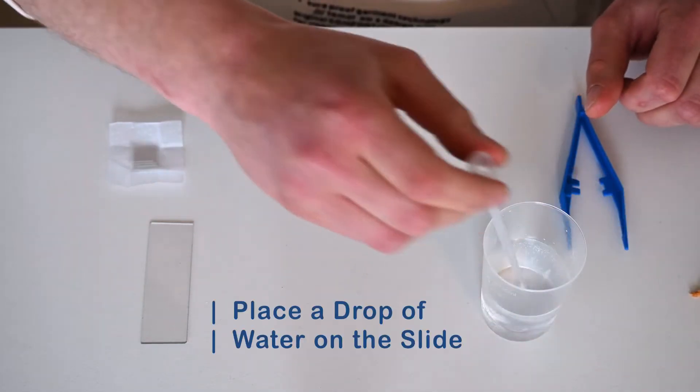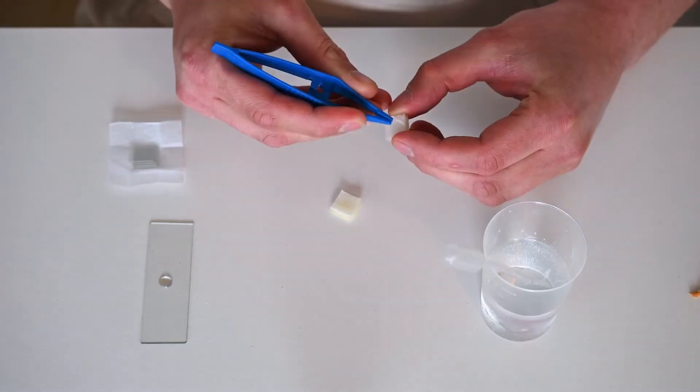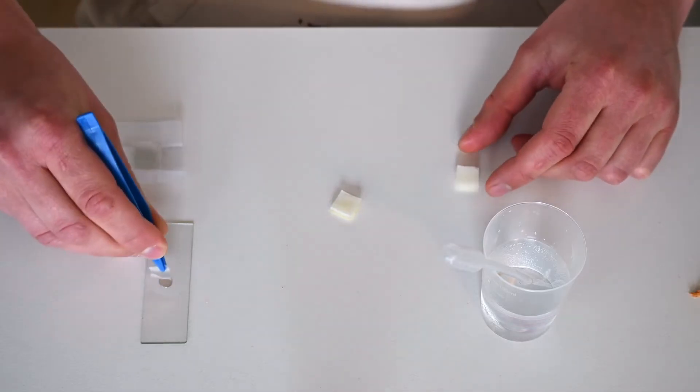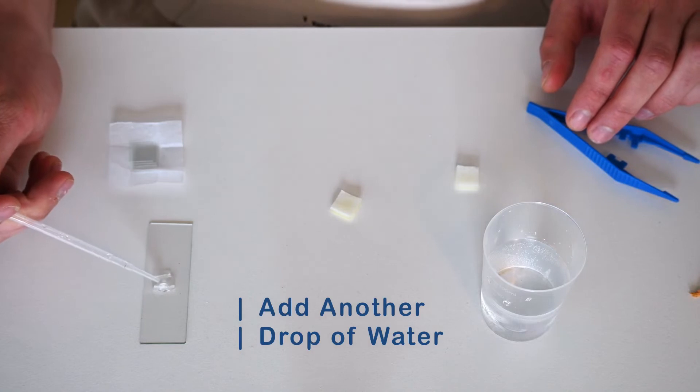Before transferring the sample to the slide, add a single drop of water using the pipette. Now you can add the thin piece of onion using the tweezers. Add a second drop of water on top of the sample and then add the coverslip.